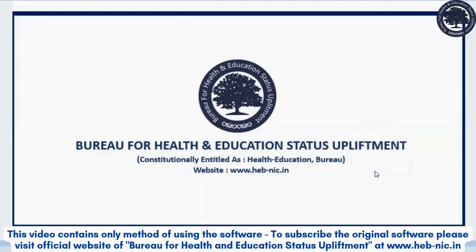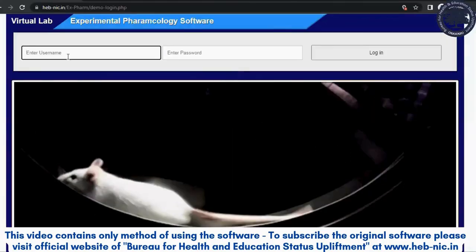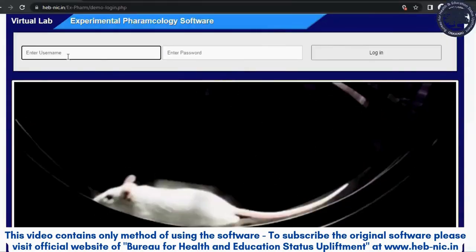In this video, we are going to perform a virtual experiment related to pharmacology, and for that purpose, we are going to use experimental pharmacology software. So right now we are on the page of the experimental pharmacology software.